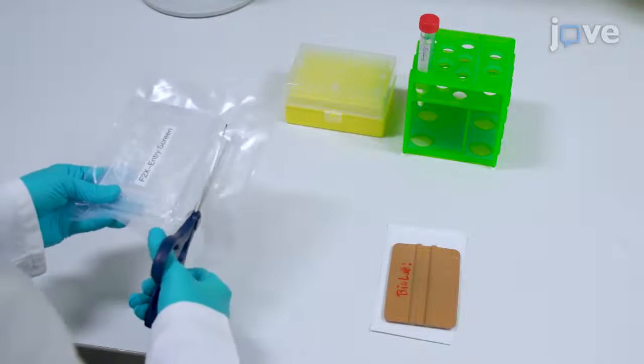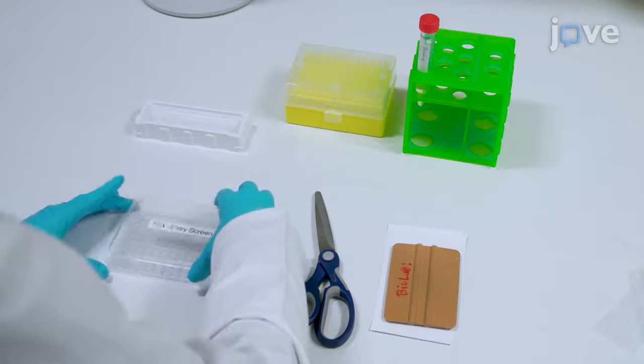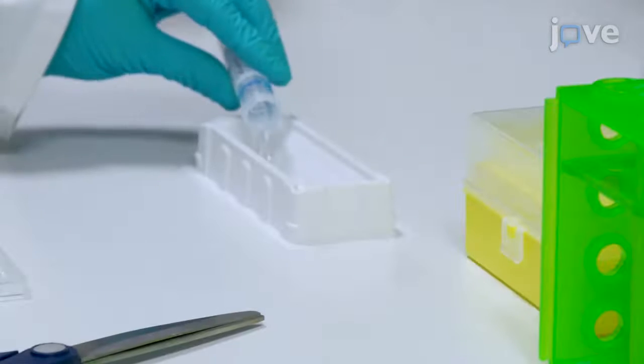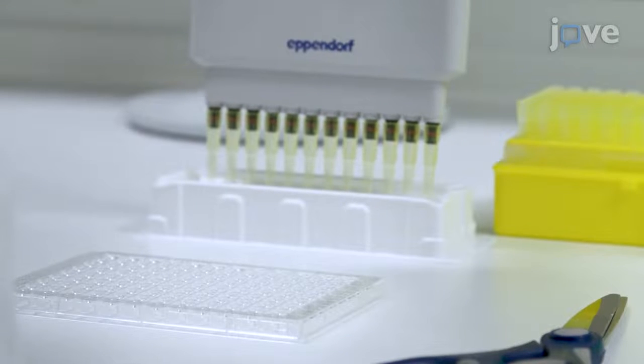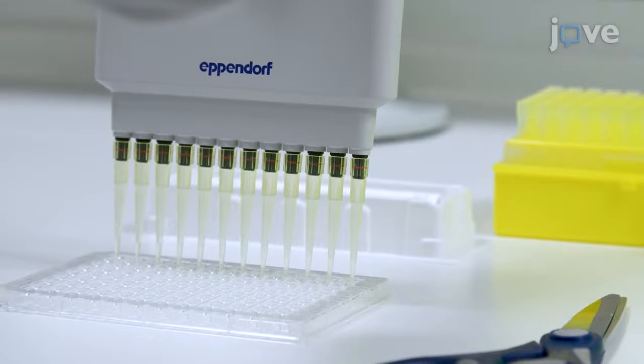To begin, cut open the bag of the screening plate pre-warmed to room temperature. Then remove the lid and the foil from the screening plate. Decant the 5 ml soaking solution in the reagent reservoir, then fill each of the 96 reservoirs of the plate with 40 microliters of soaking solution using a 12 channel pipette.